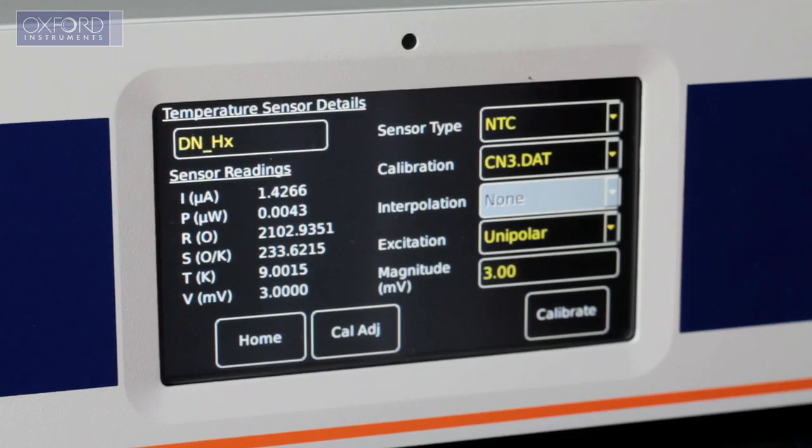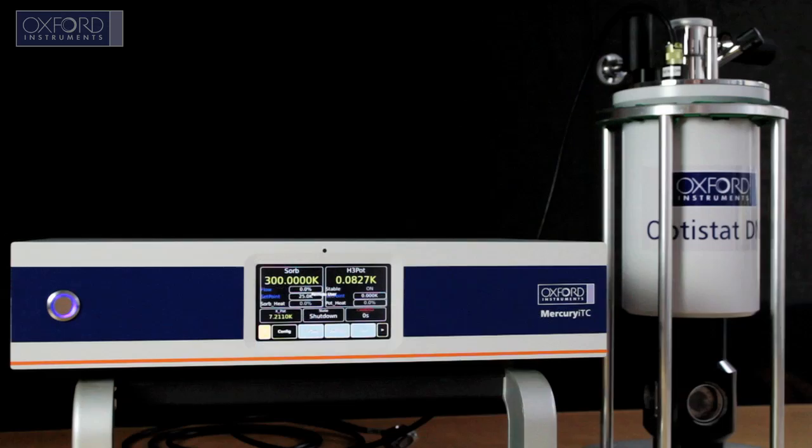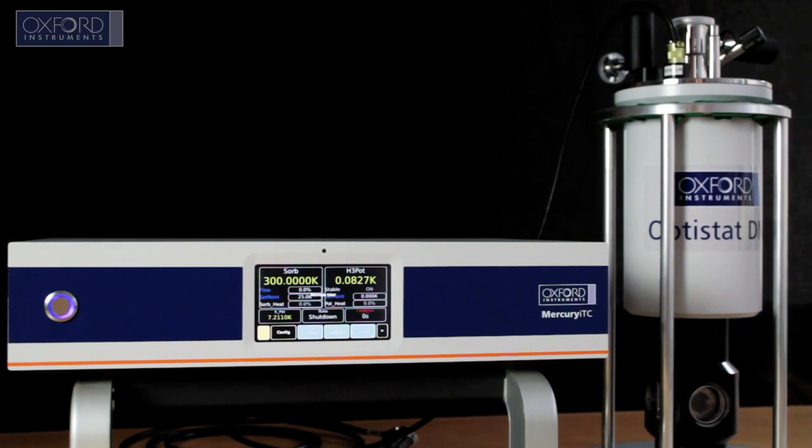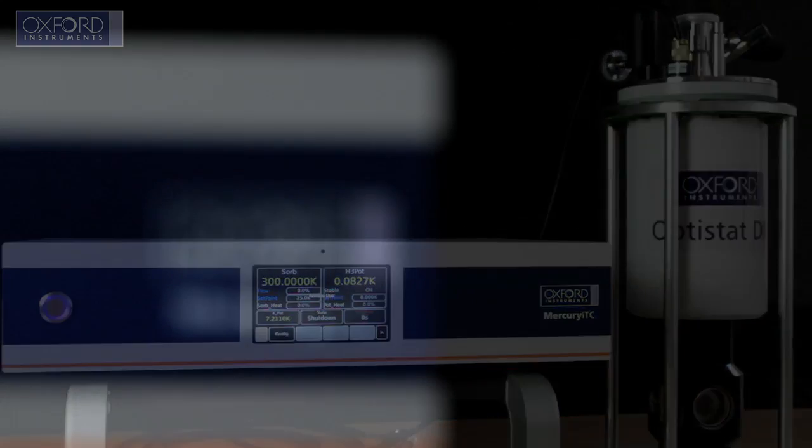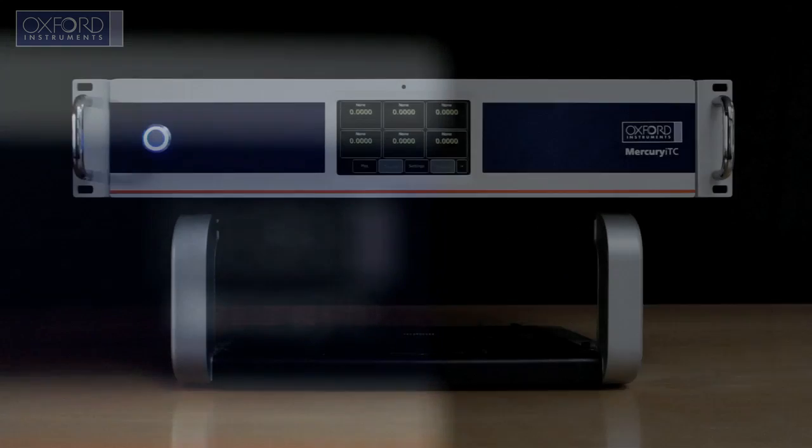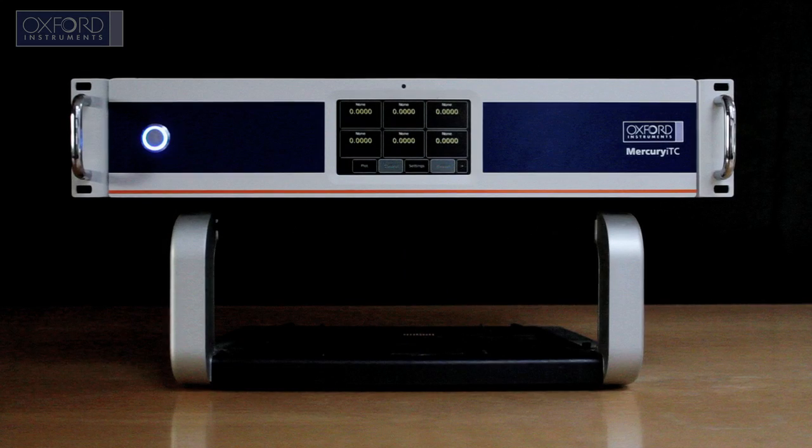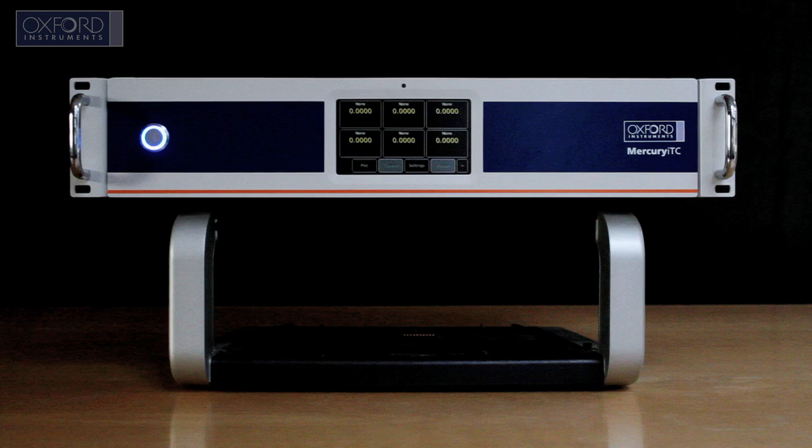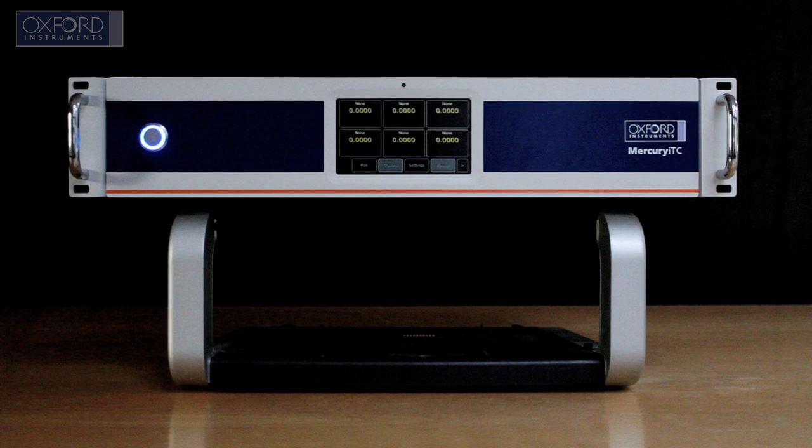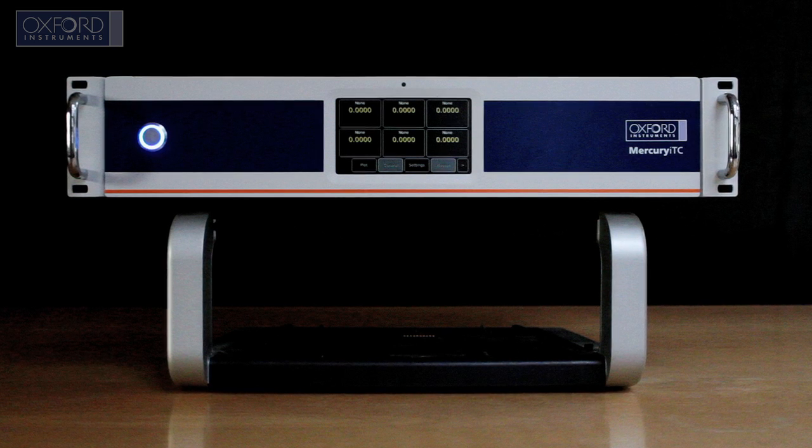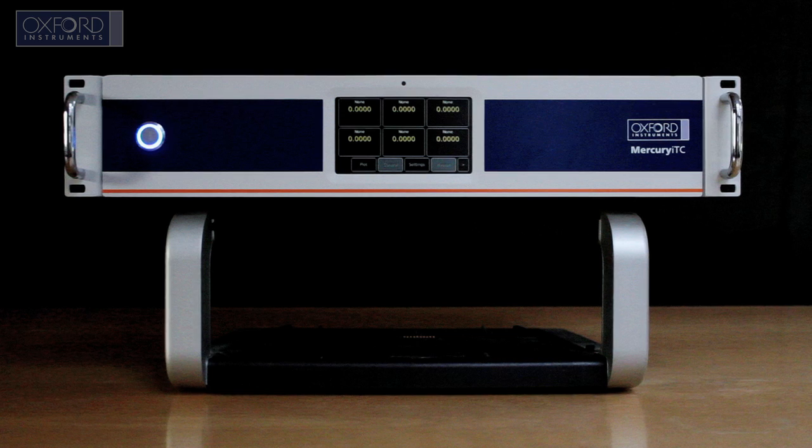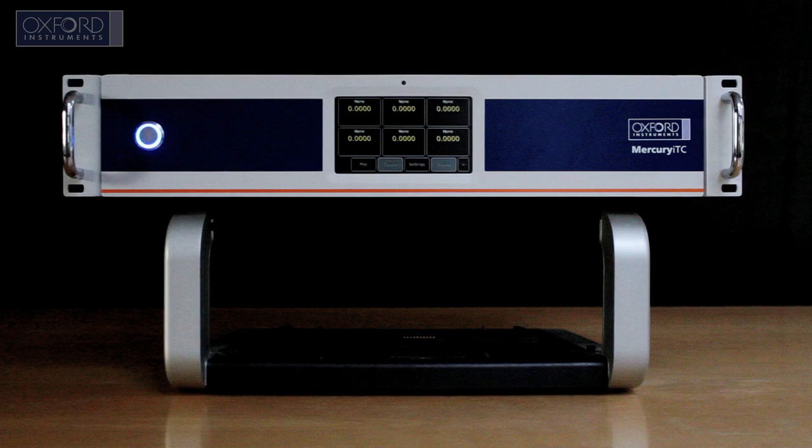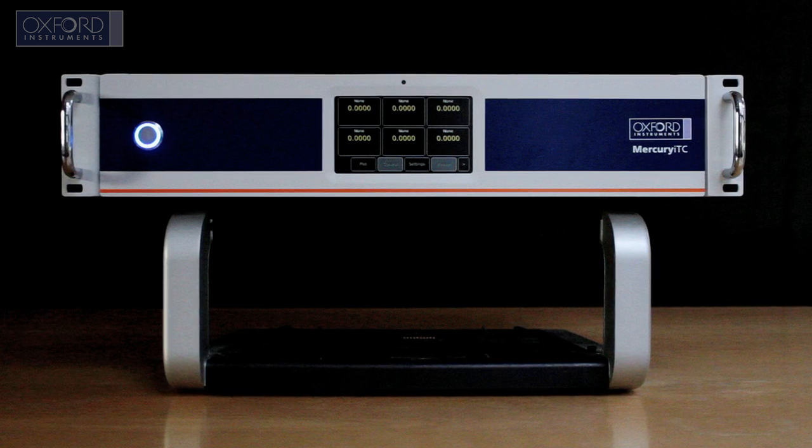The Mercury ITC supports all standard cryogenic sensors. The basic Mercury ITC includes a single temperature sensor input and 80W heater output for precise temperature control.